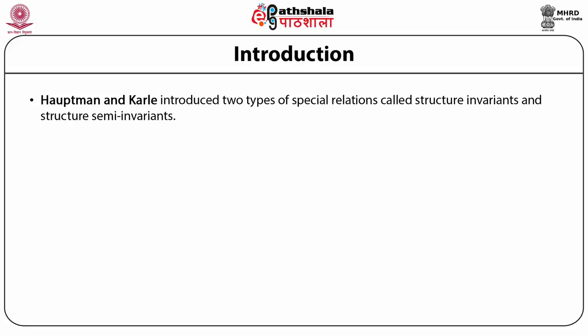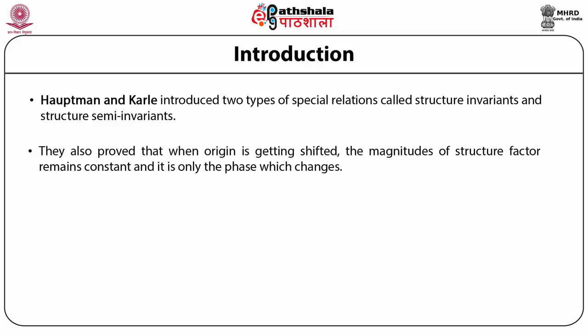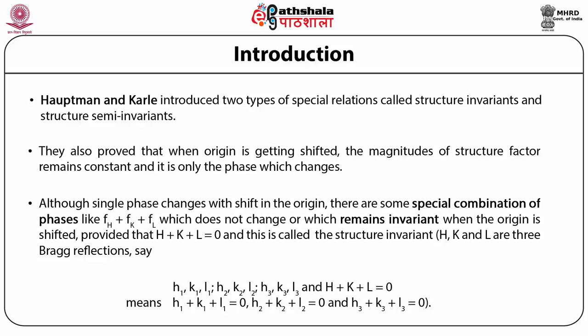They also proved that when the origin is shifted, the magnitudes of such a structure factor remain constant and it is only the phase which changes. Although the single phase changes with respect to a shift in origin, there are some special combinations of phases, like phi of capital H plus phi of capital K plus phi of L, which do not change, or which remain invariant when the origin is shifted, provided H plus K plus L equals 0.